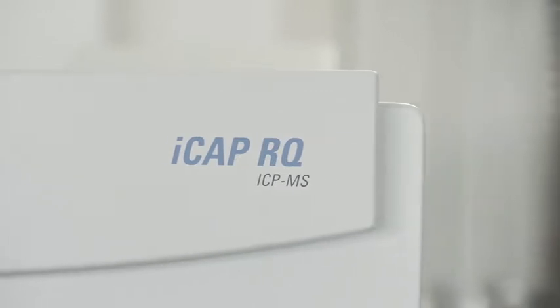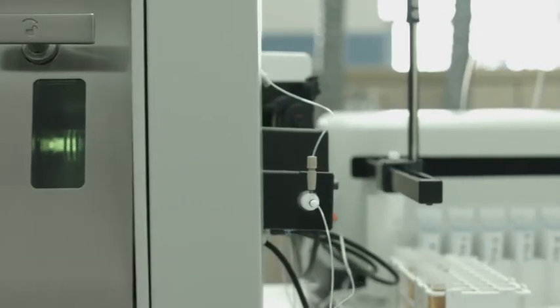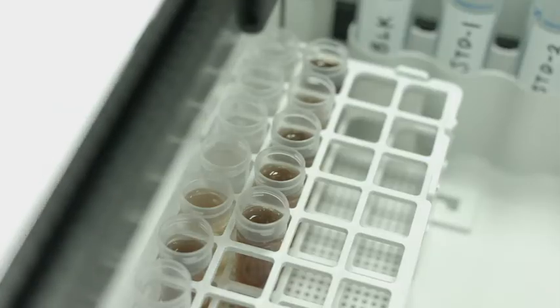Single quadrupole ICP-MS instruments such as the Thermo Scientific ICAP RQ ICP-MS are the perfect choice for laboratories testing for trace elements in routine sample matrices, from water analysis and food testing to elemental impurities analysis and industrial applications. The ICAP RQ ICP-MS features a variety of solutions that show robust operation in almost any sample matrix and comprehensive interference removal using Kinetic Energy Discrimination, or KED.